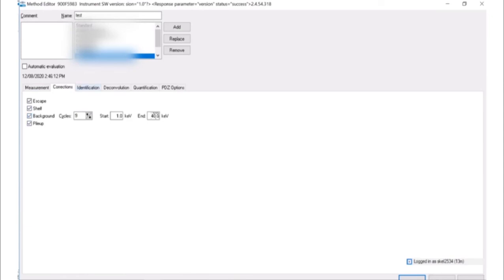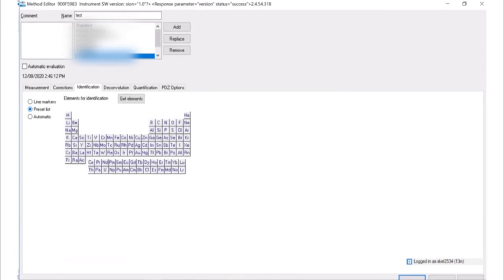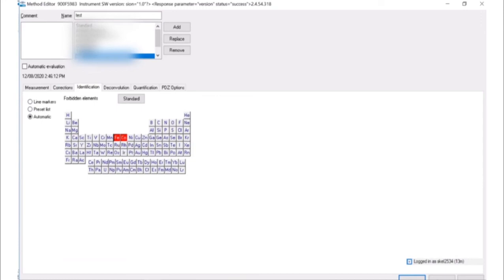In the identifications tab, check the auto box if you would like the software to automatically determine what elements are present. Or check the preset box to predetermine which elements to identify in the spectra. Once the preset box is checked, a periodic table will appear and you can select desired elements. Or if you have already run a test sample and selected elements, you can check the get elements box and the elements currently selected in the analysis window will appear in the method.